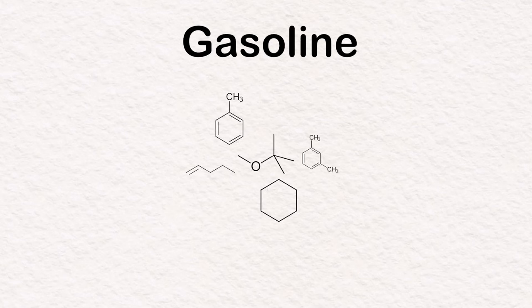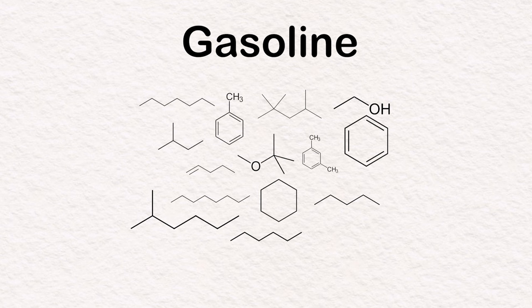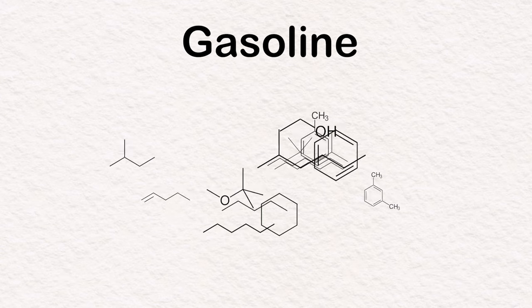Gasoline consists of many different hydrocarbons, which are useful as a fuel, but also as solvents. Therefore, I'm going to fractionally distill gasoline and roughly separate it into its components.